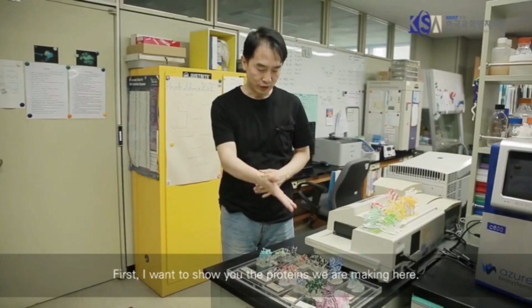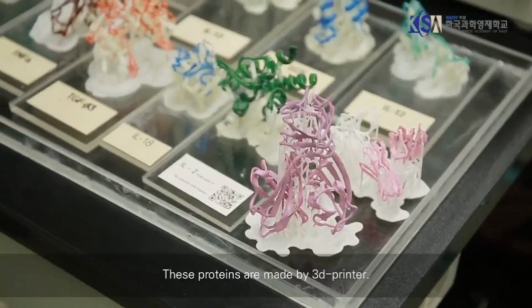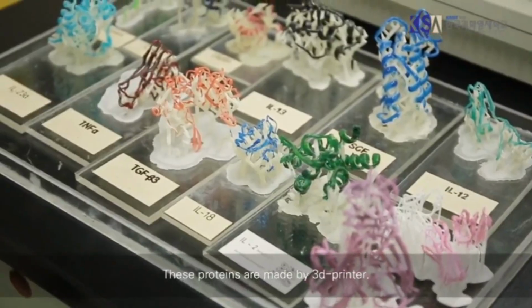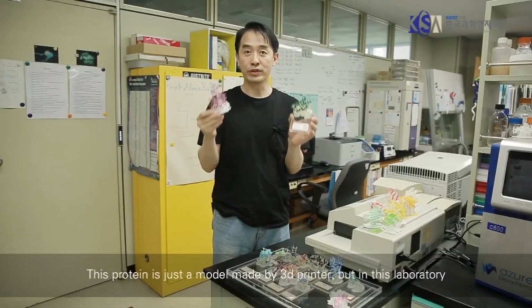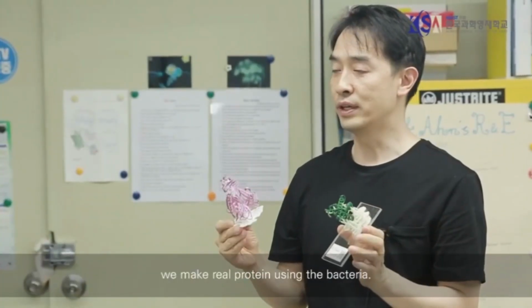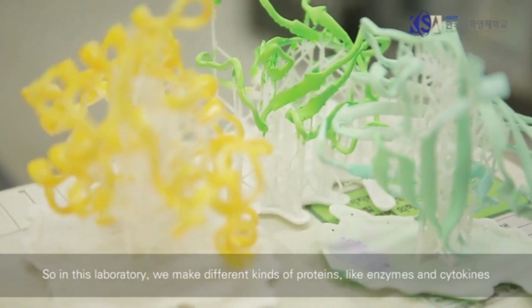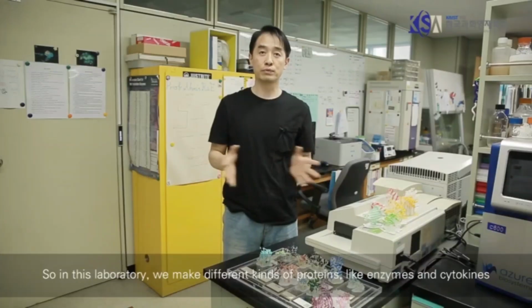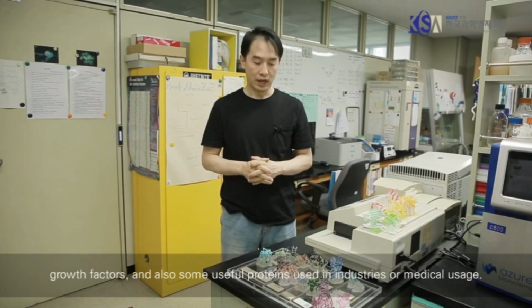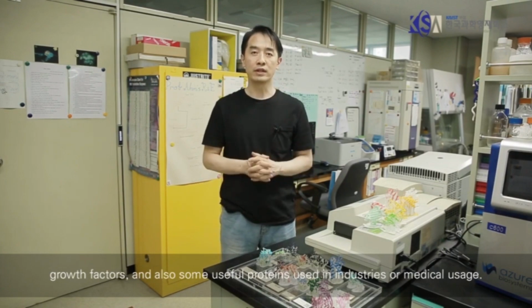First I want to show you the proteins we are making here. These proteins are made by the 3D printer. This protein is just a model made by a 3D printer, but in this laboratory we make real proteins using the bacteria. So in this laboratory we are making different kinds of proteins like enzymes and cytokines and growth factors, and also some useful proteins which are used in industry or for medical uses.